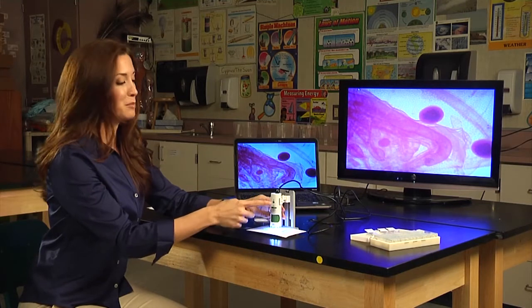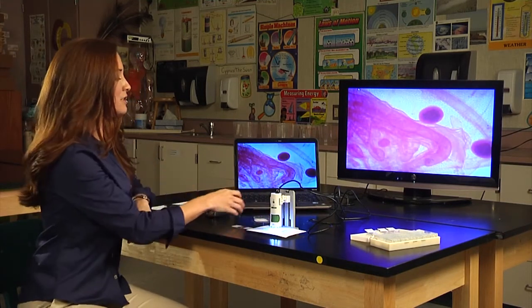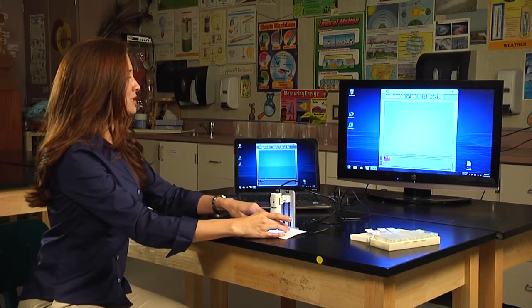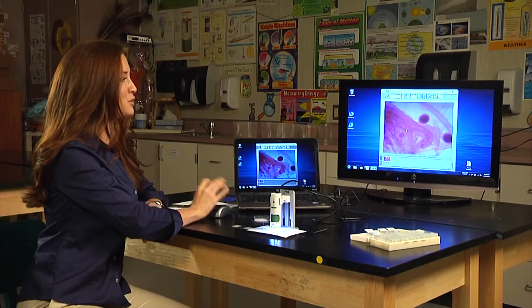We also have the ability to take pictures. So I'm going to go ahead and take one of this. Then to view the pictures, all you have to do is double click to exit full screen mode. You can scroll through all of the pictures that you've taken down at the bottom, and the last photo you took will be the last picture on here. To take a look at the picture, all you have to do is pick it up and drop it into the frame.